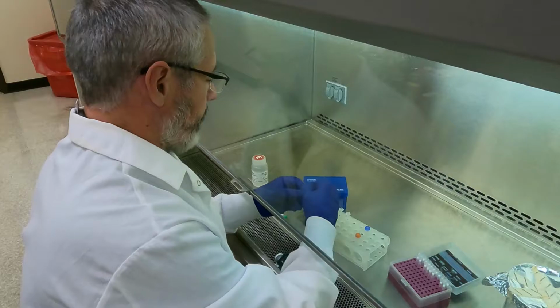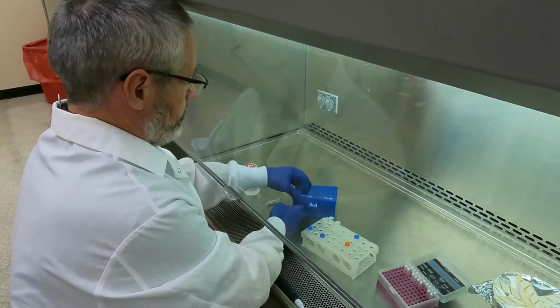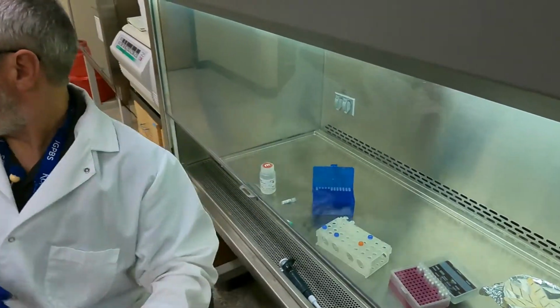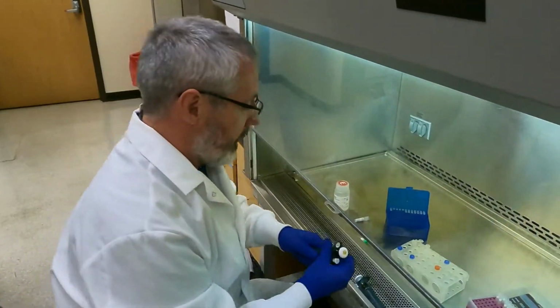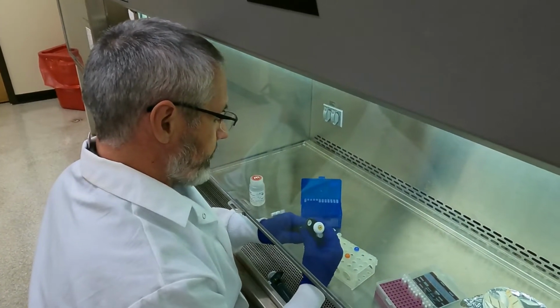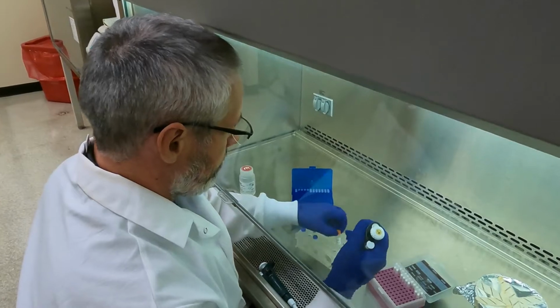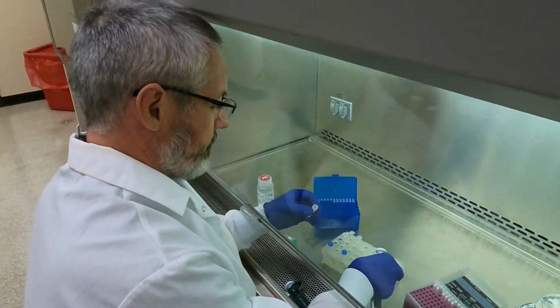So the good thing is it's relatively soluble. I'm going to use 5 microliters of the Cas enzyme for each. I'm going to get this back onto ice as quickly as possible.